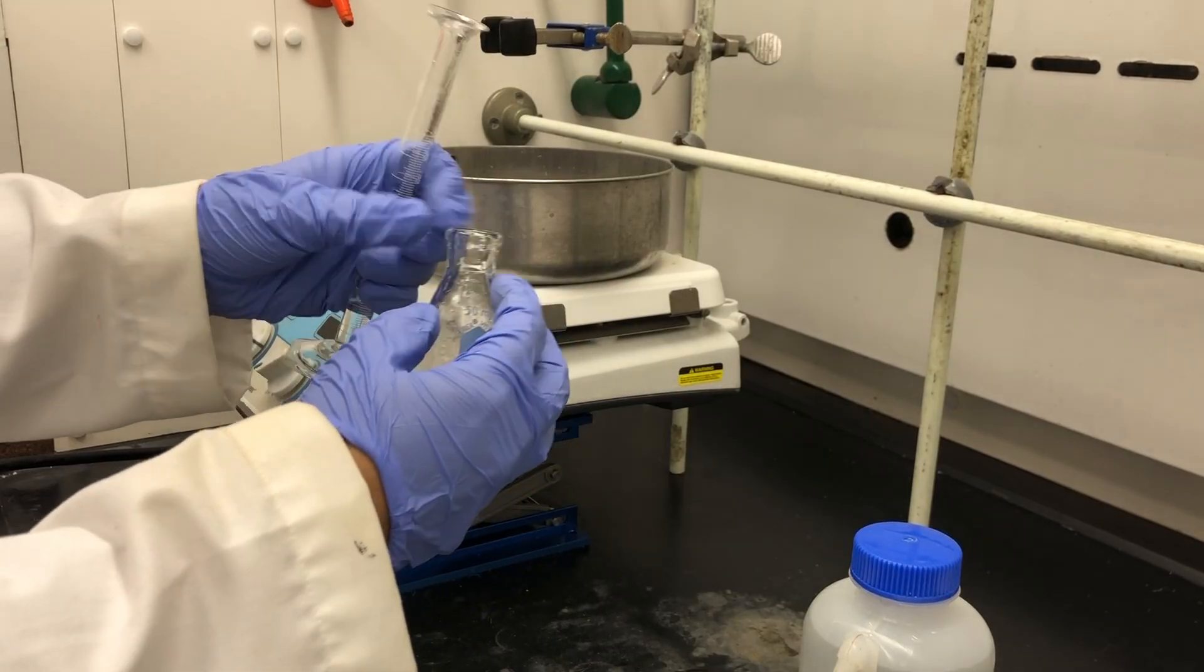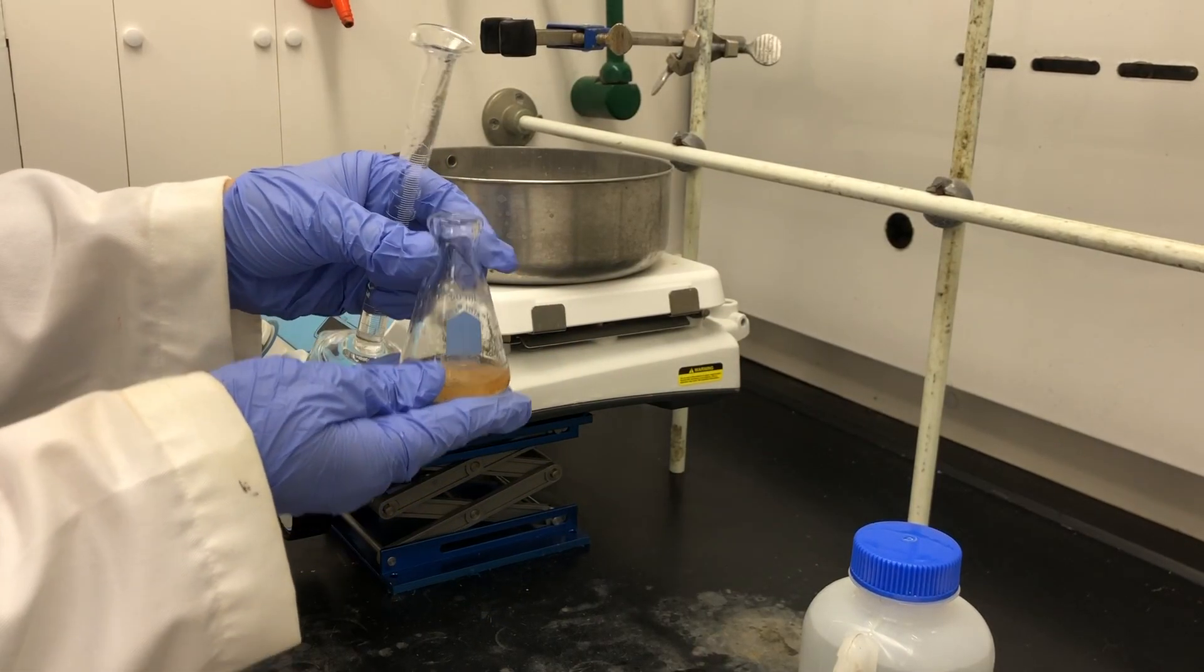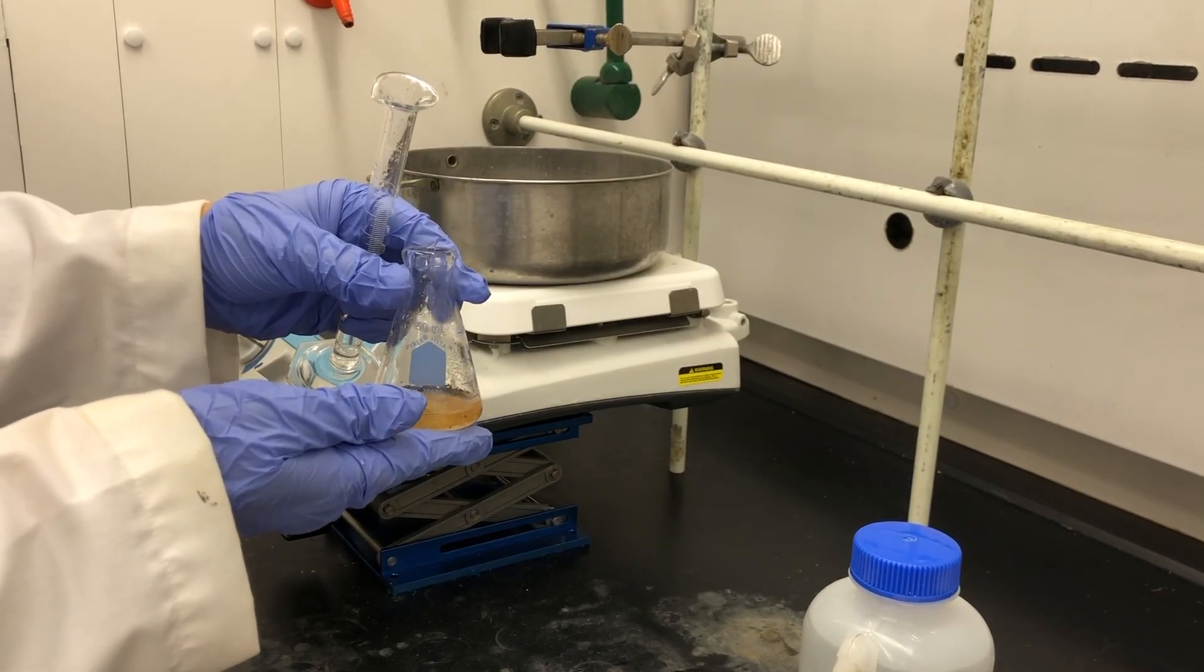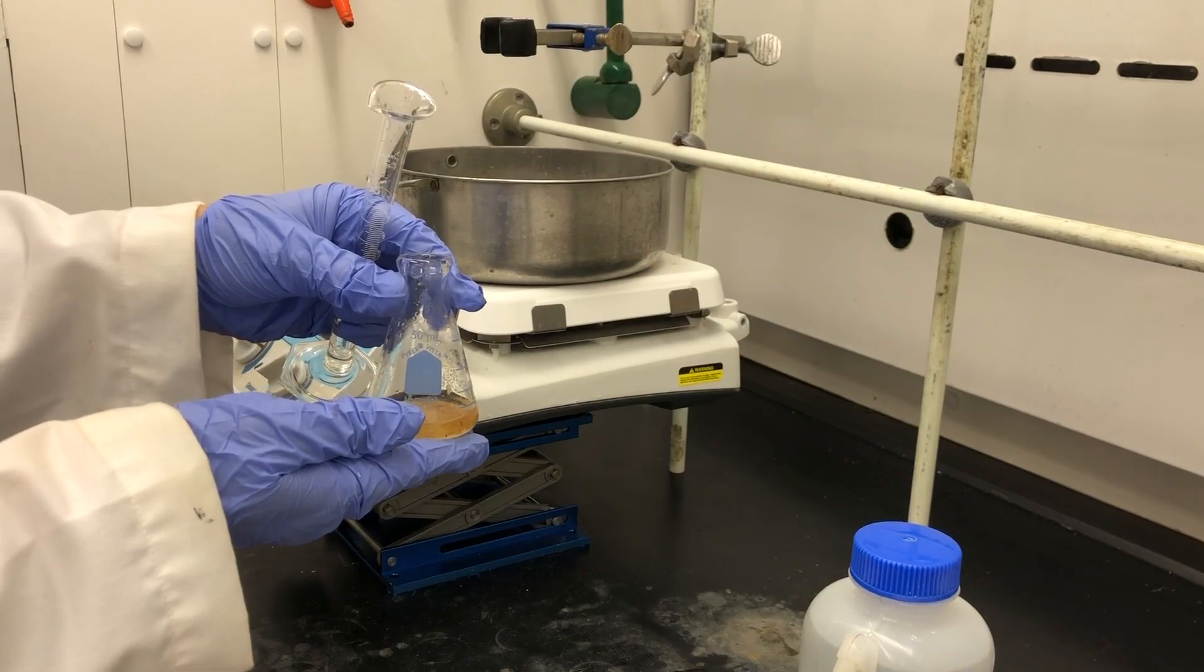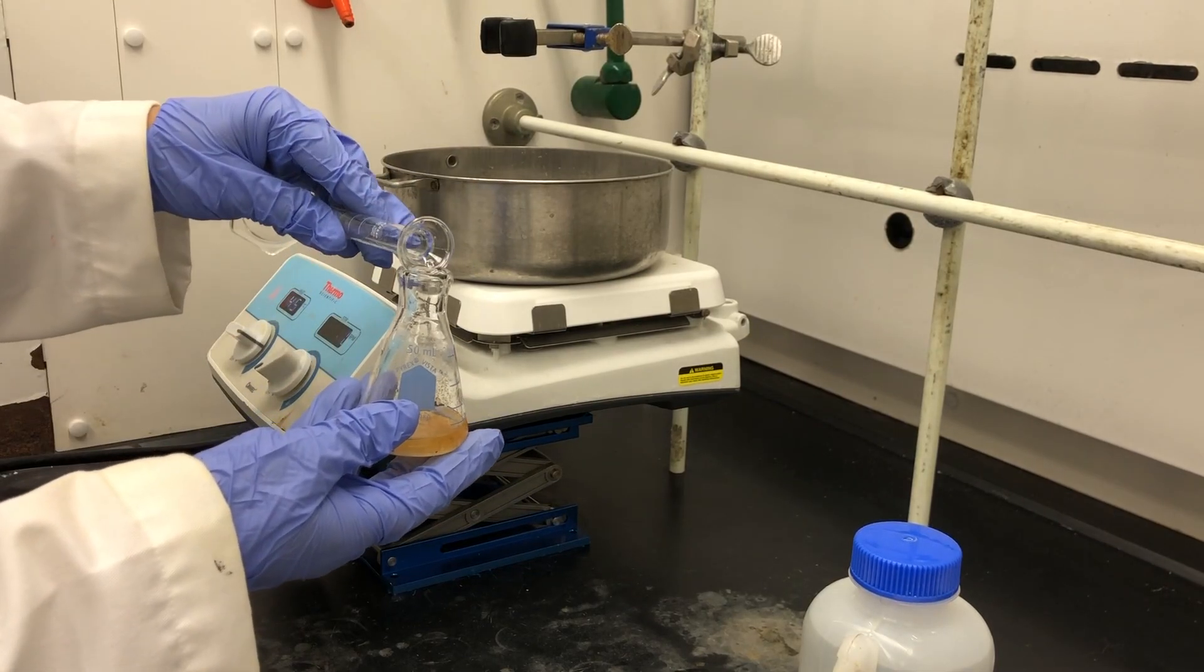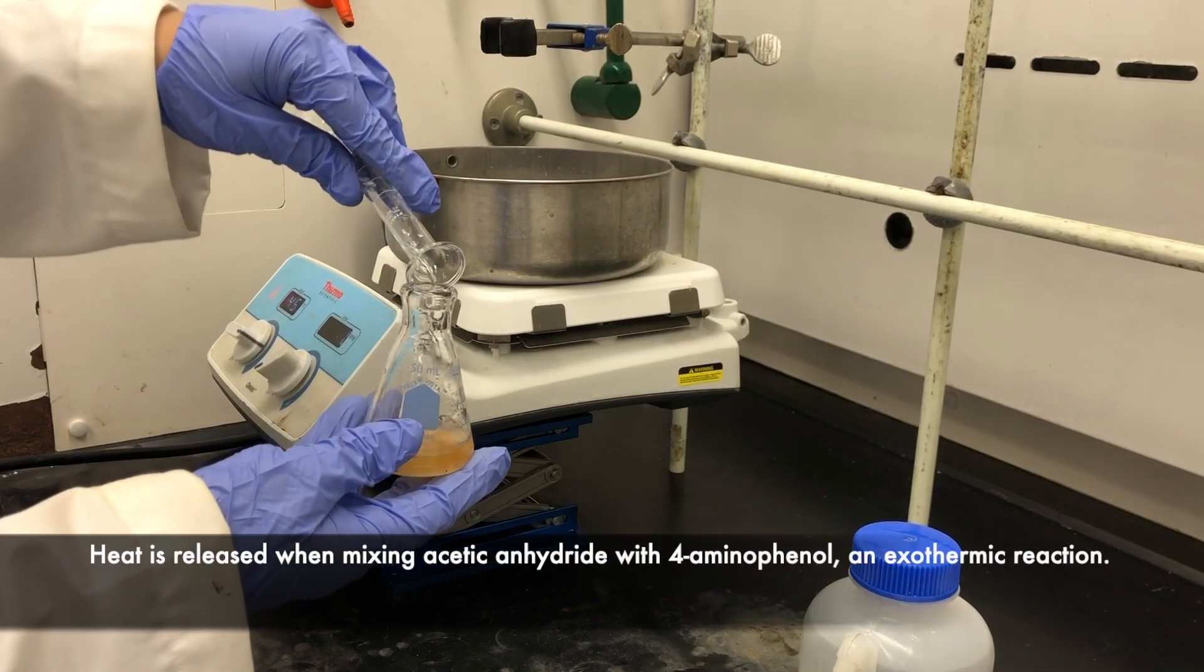If you were in the lab touching the flask, the flask is actually warm to the touch, which tells you the reaction is exothermic. If heat is being released, the reaction is exothermic, right?